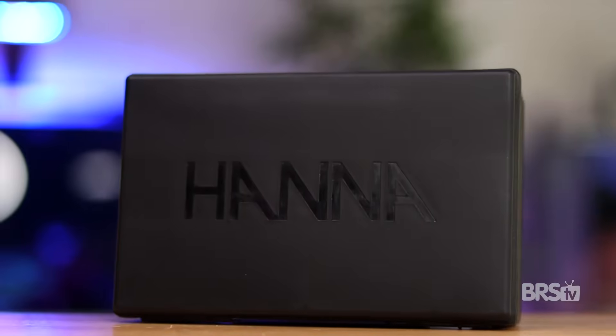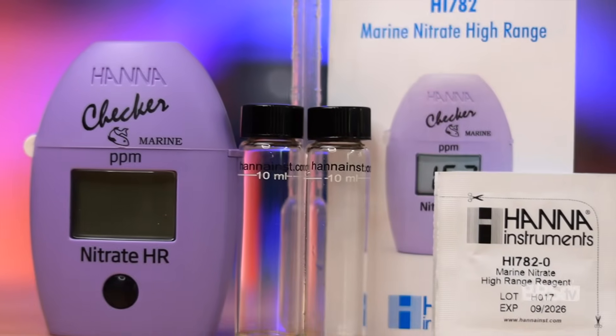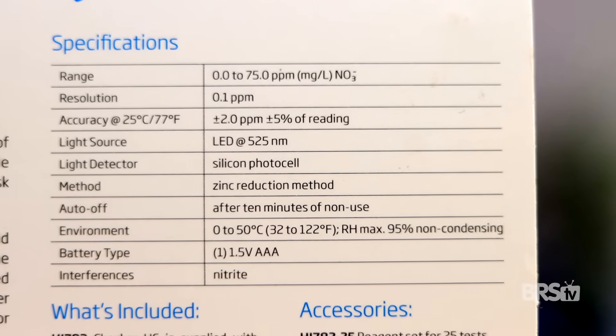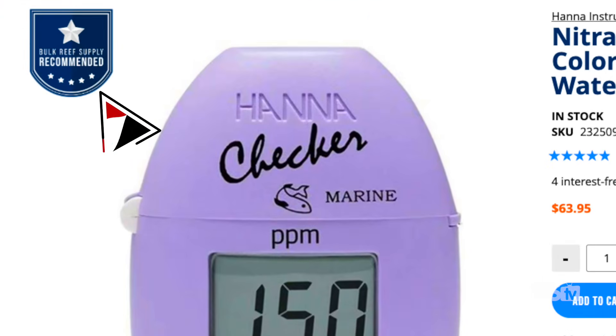HANA enthusiasts have been asking for an easy-to-use nitrate test kit for years, hopefully one with a single reagent capable of detecting the wide range of nitrates we experience in the hobby. HANA, you illustrious chemical nerds, you did it. The HANA high-range marine nitrate colorimeter measures from 0 to 75 parts per million with an accuracy of plus or minus 2 parts per million. Although it's relatively new, it's already receiving a five-star rating at BRS as well as the BRS recommended stamp.